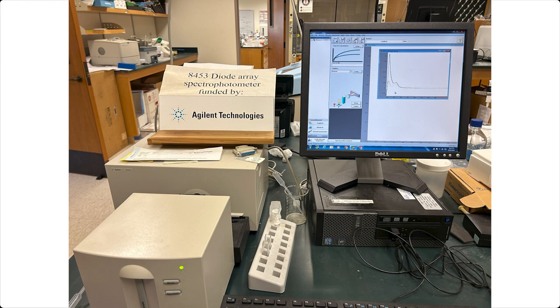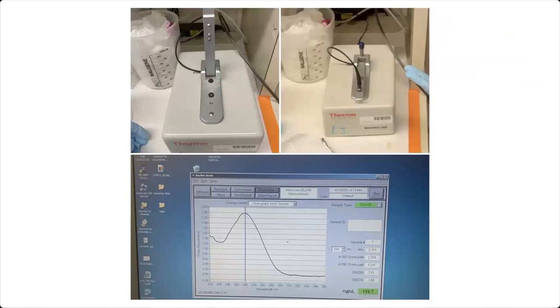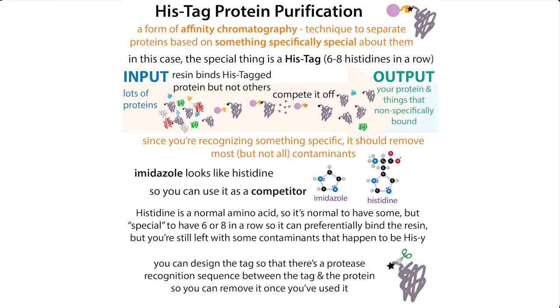If you are using a nanodrop, you probably want to do a couple of different tests of it. You can take the average. They might vary a little. Make sure that you're blanking it with whatever buffer you're using. If you have imidazole, that's going to greatly skew your values, because imidazole is basically the side chain of histidine, and so it's going to absorb a lot of light. So you need to make sure you take that into account.